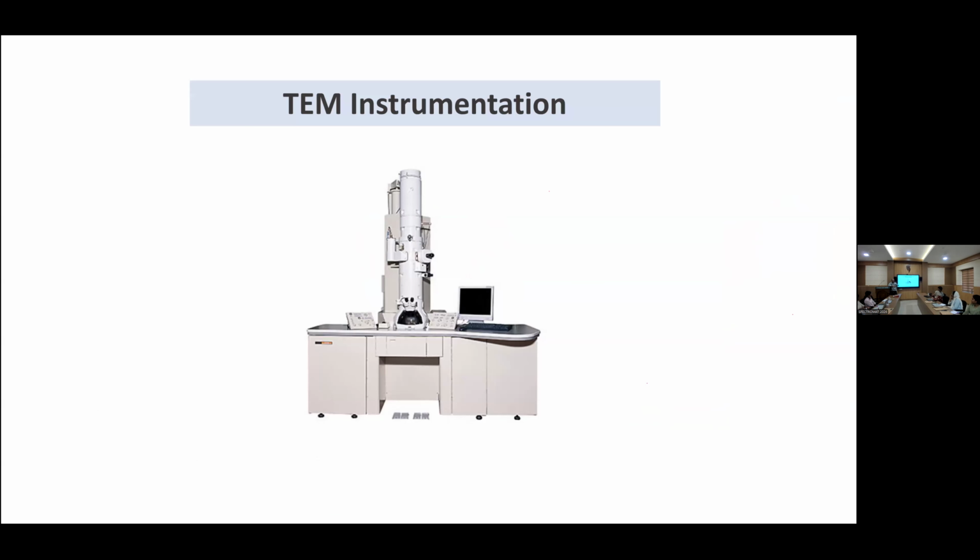Okay. So we can move to the instrumentation side. Before that, in this operation mode, everything clear, right? This imaging mode, SAD mode, lattice mode. Yeah.